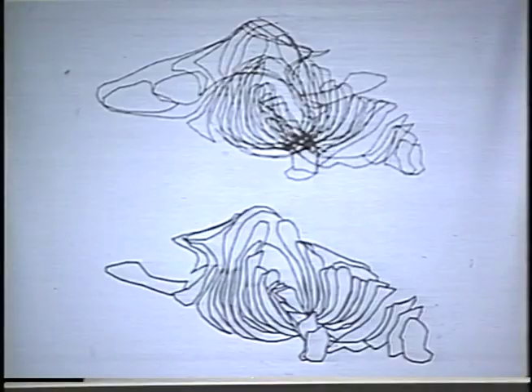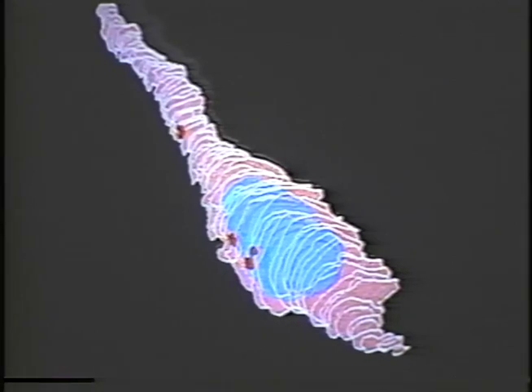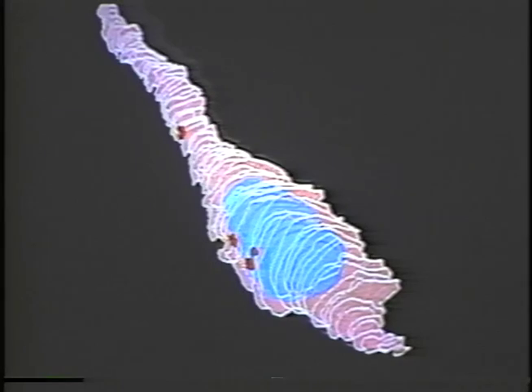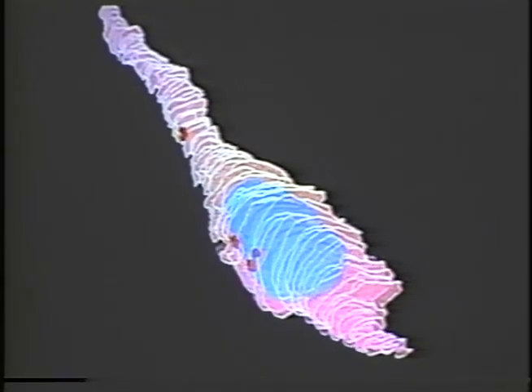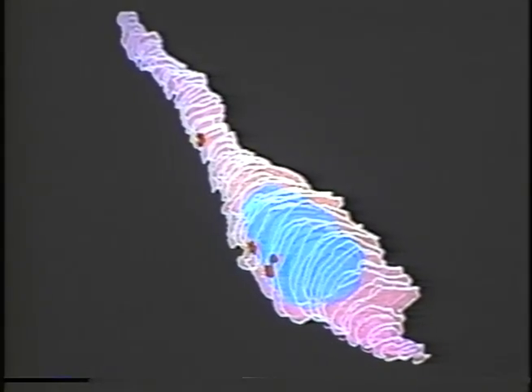Next slide. This is the kind of reconstruction we get with our IBM PC-based system. This is a stacked plate reconstruction. It uses hidden lines such that with this cell from a taste bud, the cell membrane is represented by the white contours with the pink fill. And you can see that the white lines in each successive section cover up the white lines in the background.